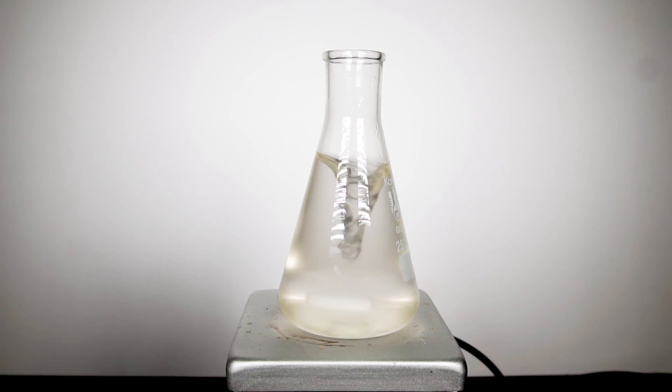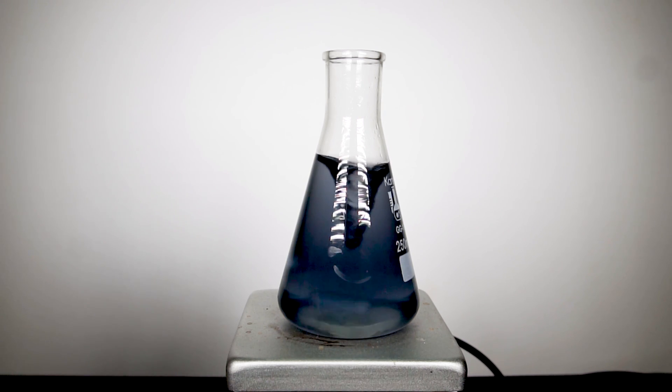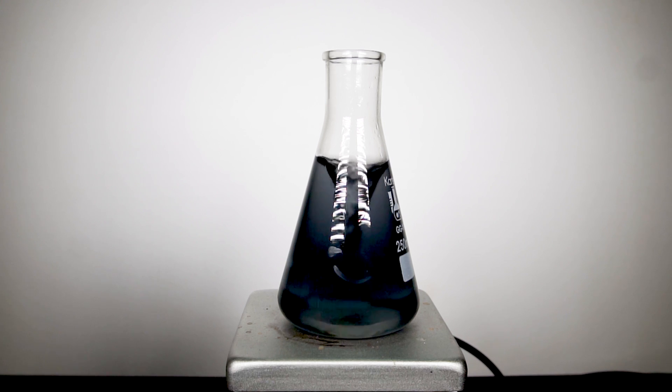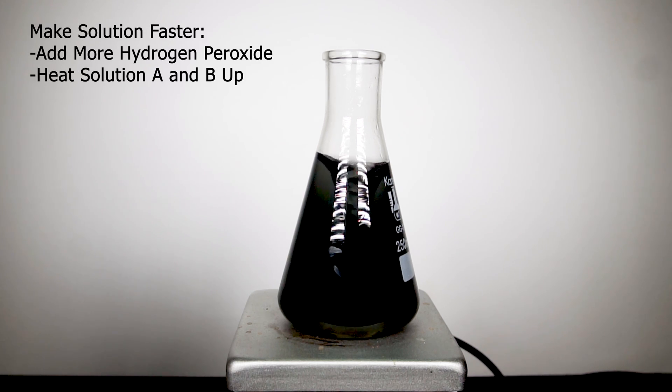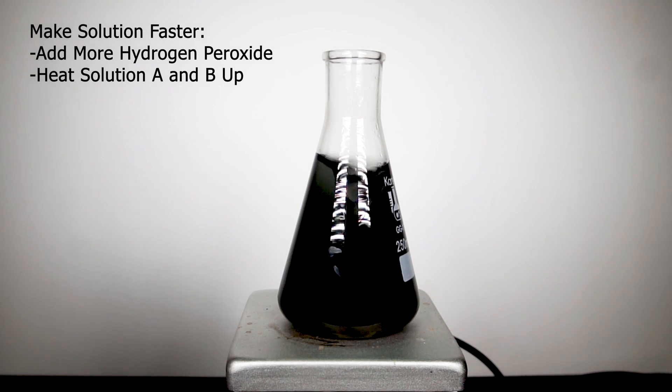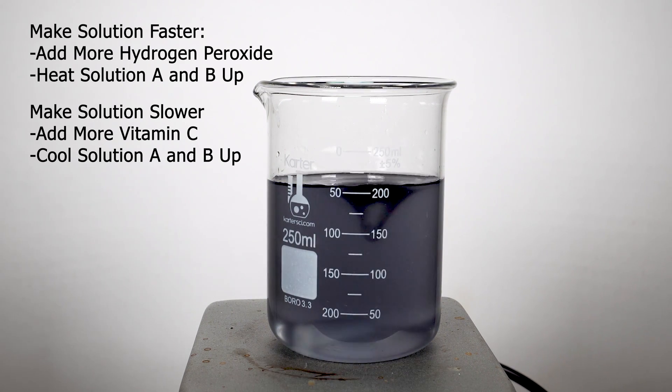Earlier I mentioned how this was a great example of kinetics, and these multiple reactions are why. We can either increase or decrease the reaction by either changing the quantity of our starting materials or changing the temperature in general. To make everything go quicker, we can add in additional hydrogen peroxide as well as increase the temperature. Or if we want to make things take longer, we can increase the concentration of vitamin C or lower the temperature.